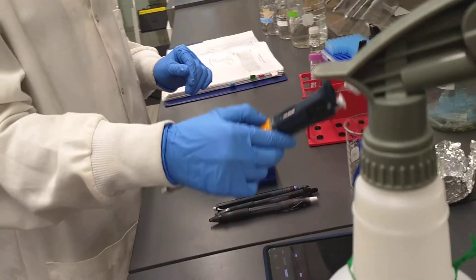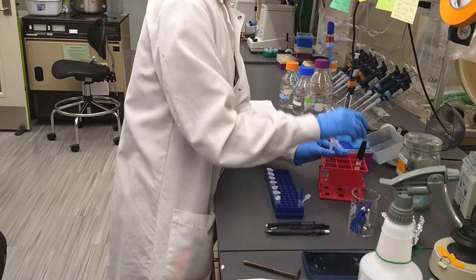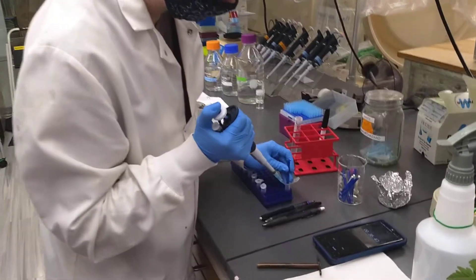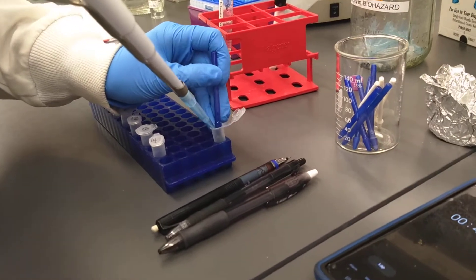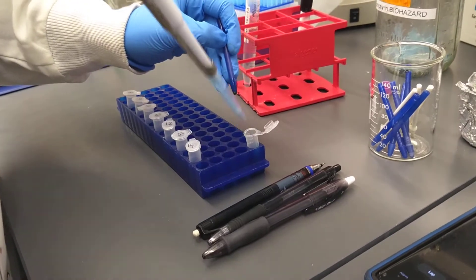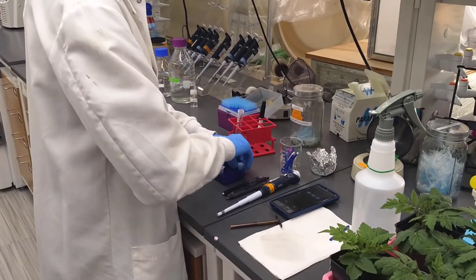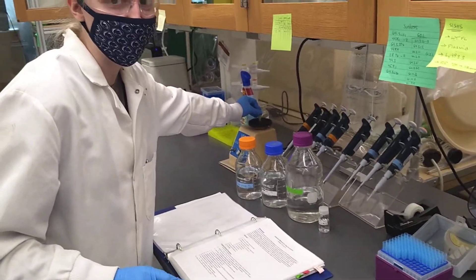We're going to add 400 microliters of Edwards extraction buffer. If you get good at this, what you can do is actually use the buffer to wash off the micropestle as you pull it out — this helps make sure there isn't any tissue left. Then the micropestle goes into our dirty pile, and the tube gets vortexed for about five seconds.